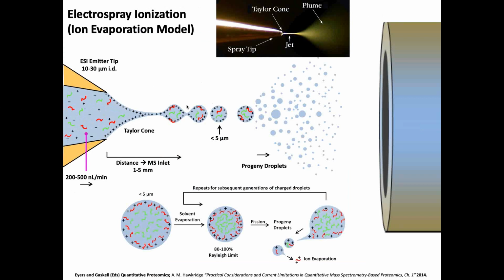It's like what happens when you perspire in the middle of summer and you're sweating. The idea is that as that perspiration, that sweat, evaporates, it takes heat with it and cools you down. If you don't put heat back into that system, you'll basically end up electrospraying ice cubes at the end of the day. So temperature is a factor.